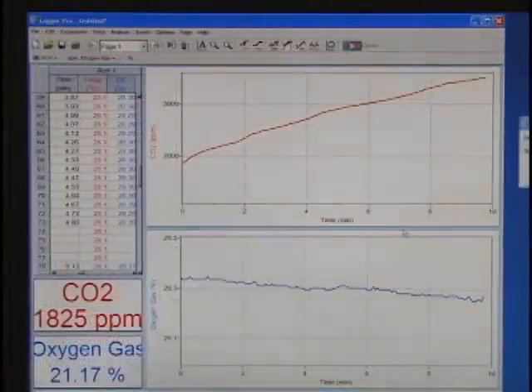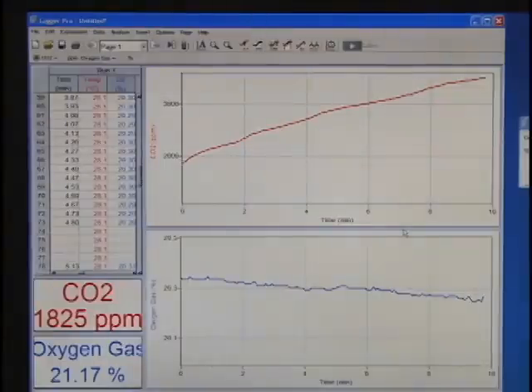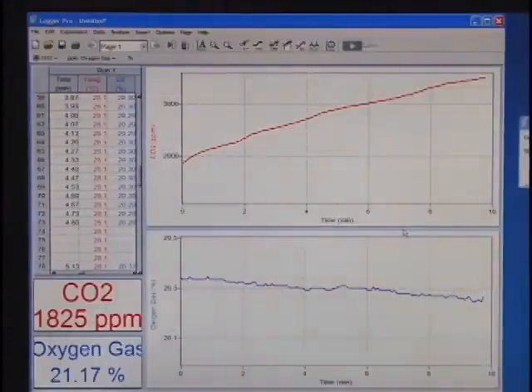When data collection is finished after 10 minutes, remove your sensors from the biochamber and pour out the peas. Flush out your bottle with water to remove any remaining CO2.